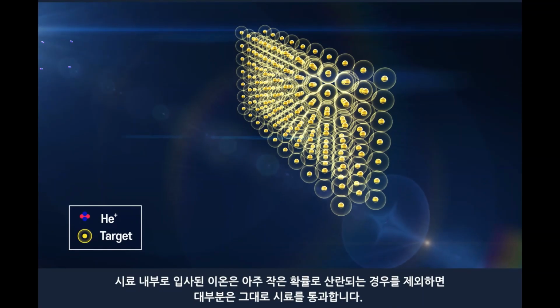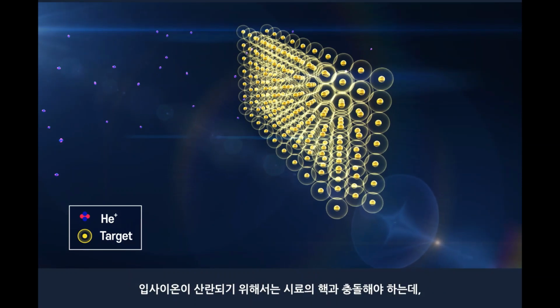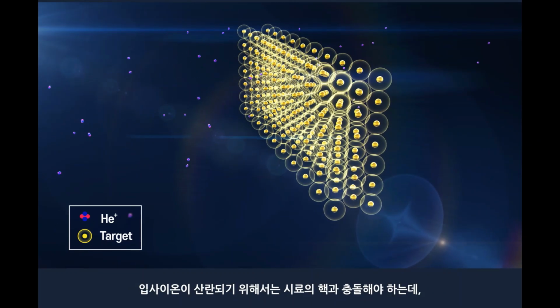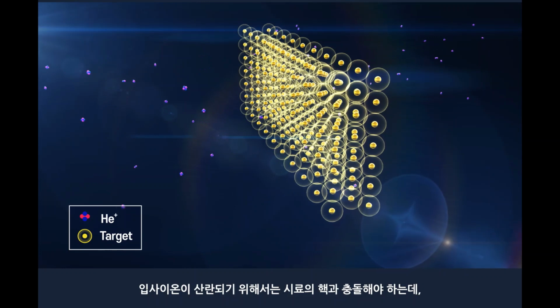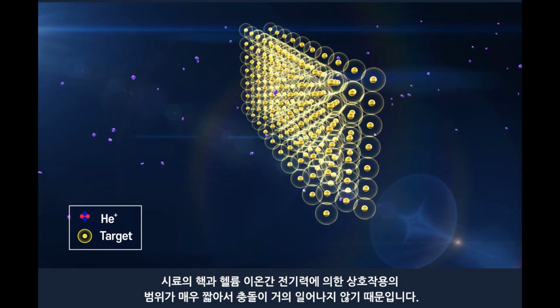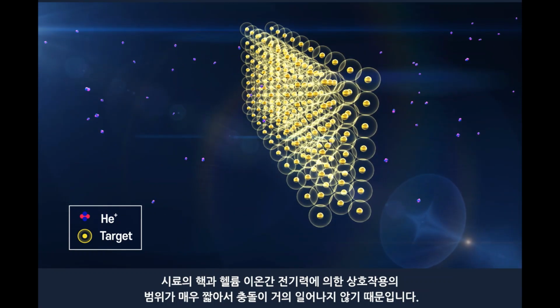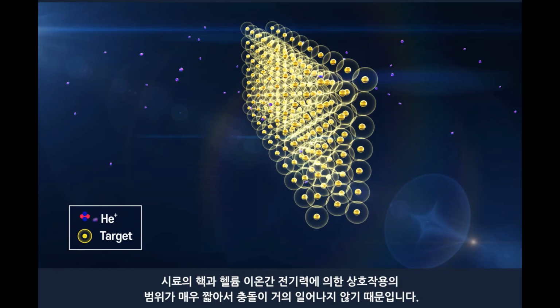Most ions that are incident on the sample penetrate the sample without being scattered. This is because the incident ions must collide with the sample nucleus to scatter. However, the interaction range owing to the electric force between the sample nucleus and the helium-ion nucleus is very short, therefore, collisions rarely occur.